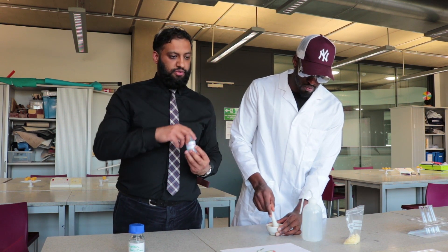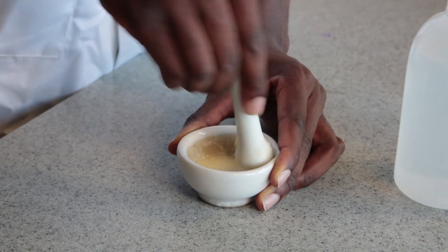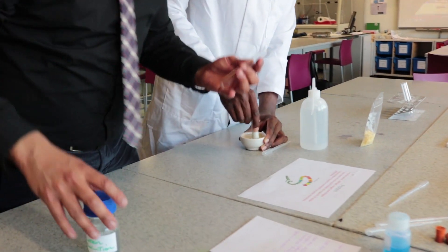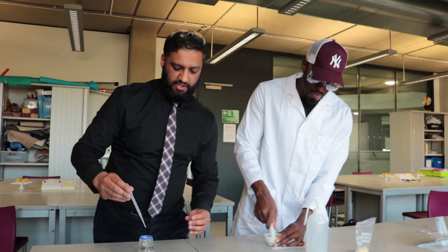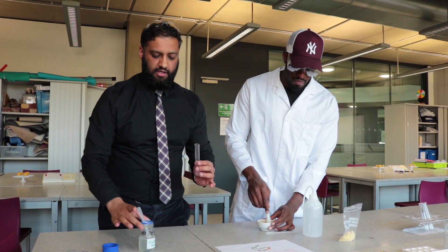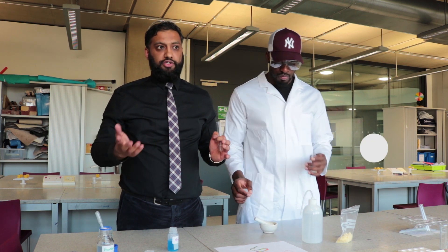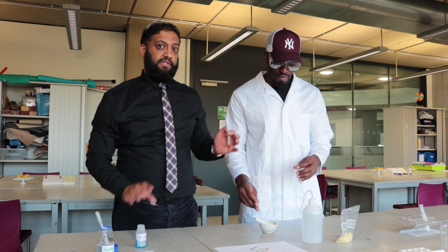We're going to add biuret solution into the two samples we're going to make. Add some cheese in there, then add some distilled water to make a little paste, then add it to the test tube. Students get mixed up with the two solutions because they're both blue. The previous solution was Benedict solution - the biuret solution is also blue and students get so confused in exam questions. Biuret solution is for proteins; Benedict's is tested for glucose.